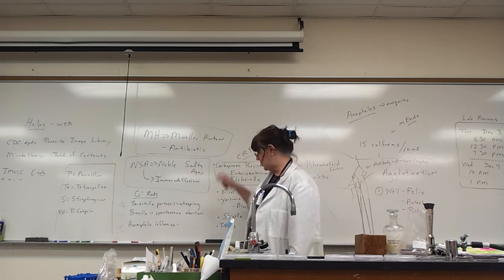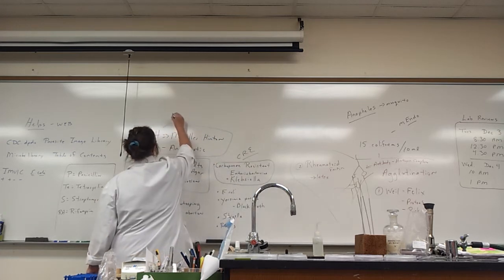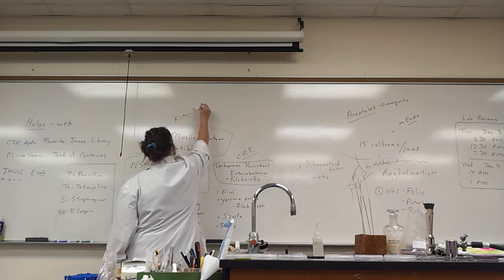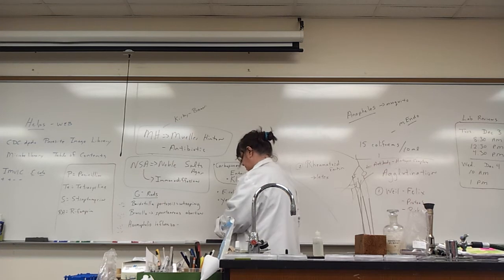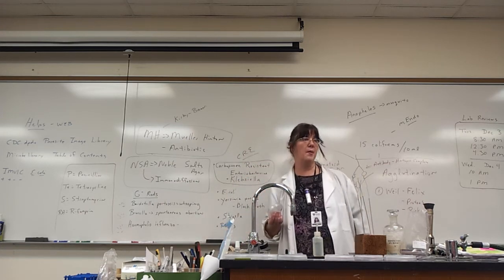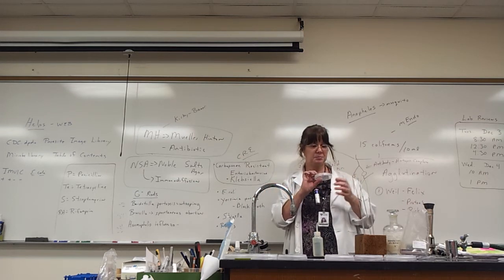Now, the proper name, I'll put it up here for the antibiotic test. If you ever see this in a lab, it's called the Kirby Bauer test. Other people don't even call it that anymore, they call it the antibiotic test. Other people still stick to Kirby Bauer. You'll see both out here.